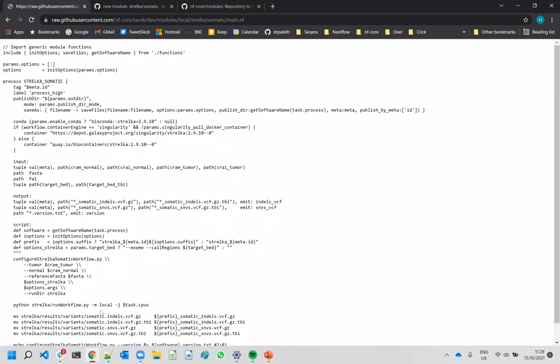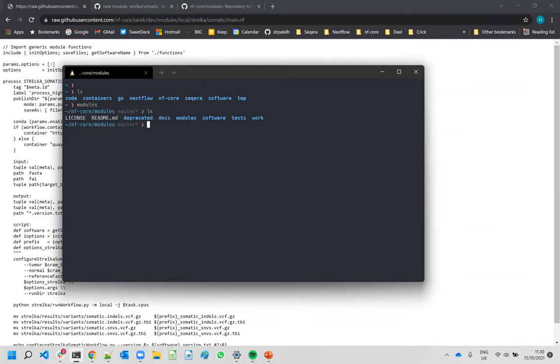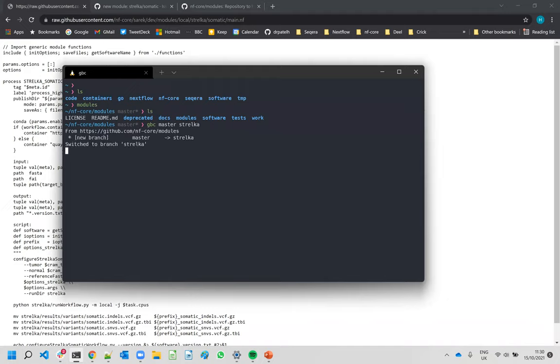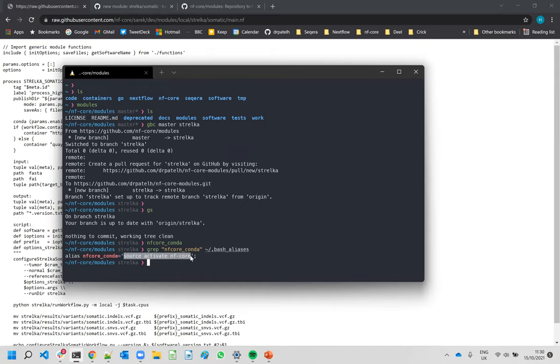This is the module we want to add. Opening a terminal — I have a shortcut to the modules repo which I've cloned, and I'm currently on the master branch. I've got an alias to create a branch off master called 'strelka'. So now we've got a clean branch created off the master branch of NFCore modules. I've also got another shortcut that activates my dev conda environment — so I just source it and the NFCore command is available for me to use.